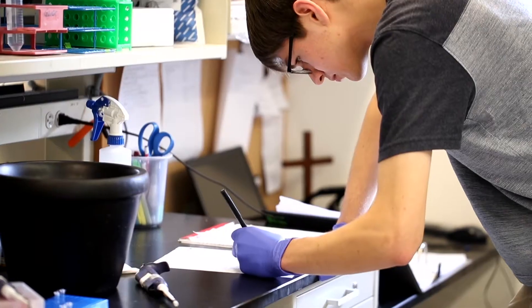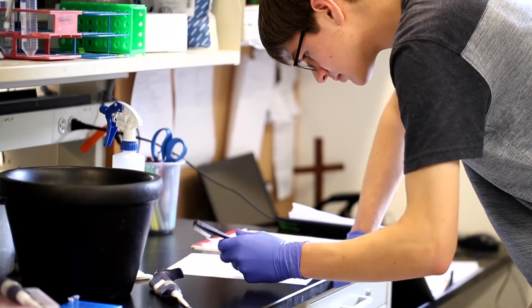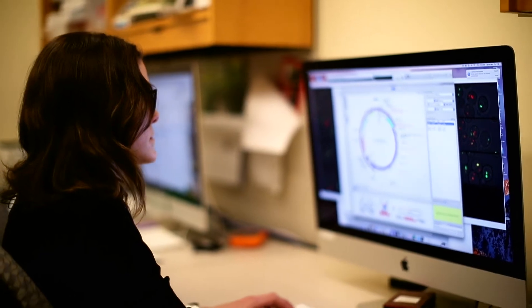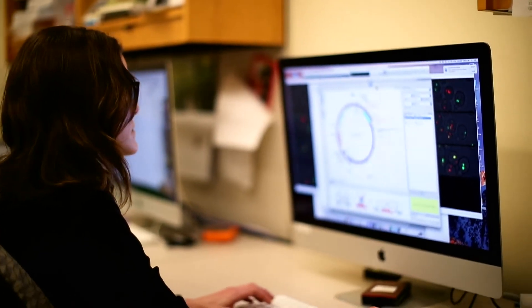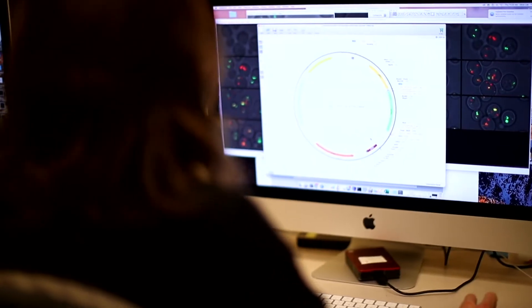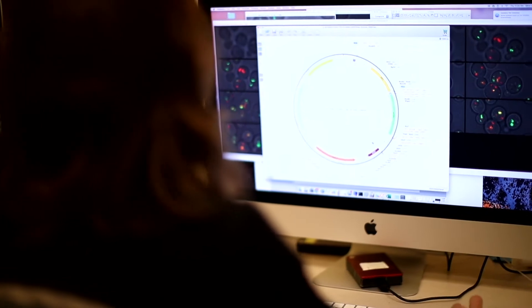SnapGene aims to solve three problems that people face when they're doing DNA cloning. The first problem is planning a procedure. Every DNA cloning experiment is different and you need to map out all of the steps you're going to do to get you to the end. So SnapGene is set up to guide you through that workflow.